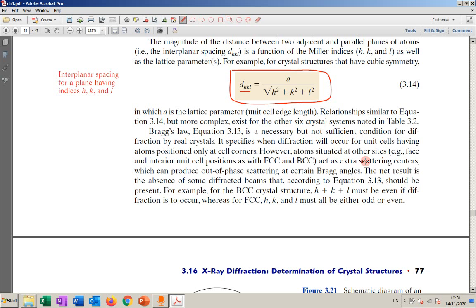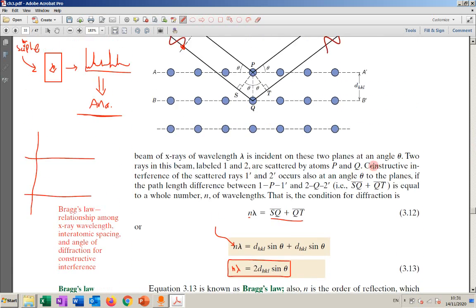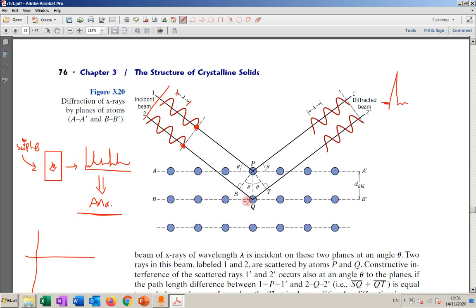Now we explained scattering and we solved some examples regarding XRD, but we have the crystal structure. Now there is other information that we need to know in order to fully analyze an XRD pattern. Now the Bragg's law that we have gives us an indication that for some planes, we have equivalent planes and they will give us a peak.